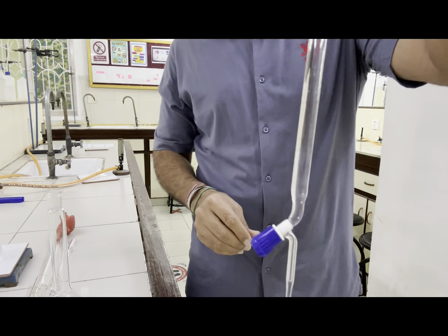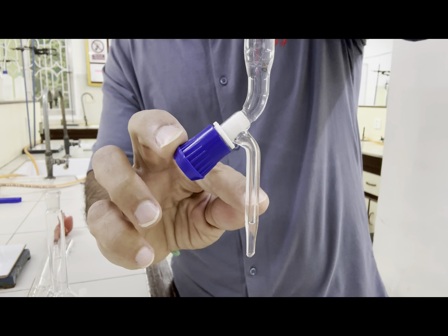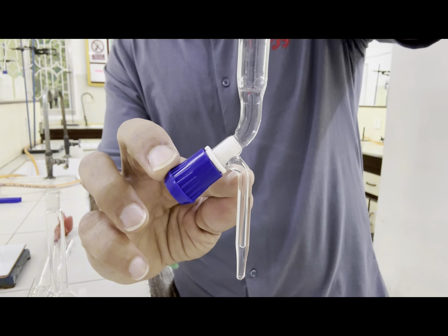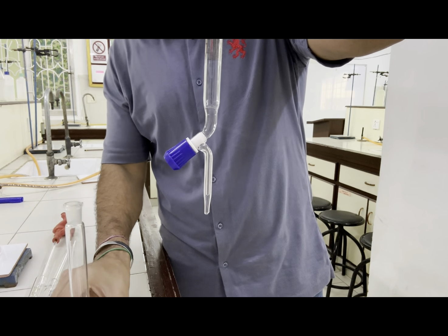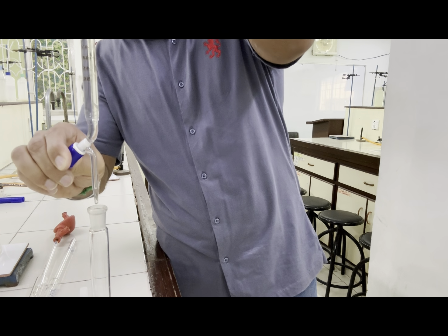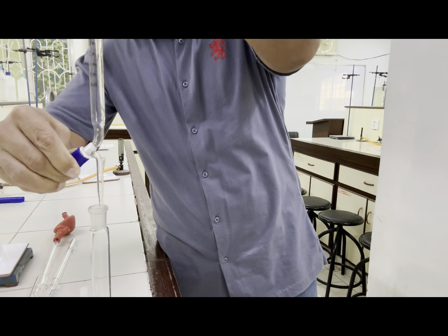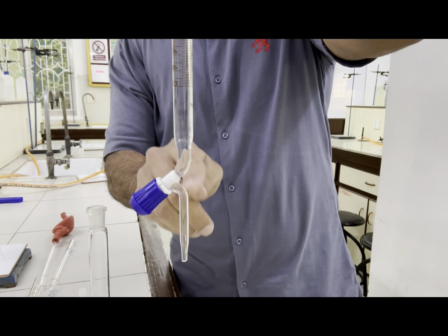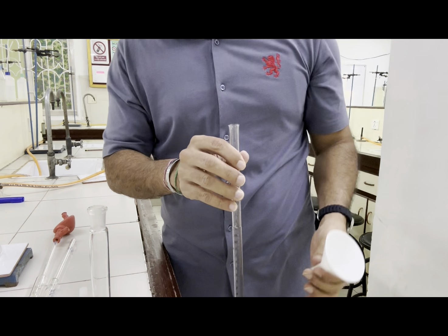Now have a look at this lower end. There is a volume in this burette which is below this knob, and this needs to be filled also. Therefore we will open this knob so that the solution will drain out and then close. And now you can see this column is filled. Actually this includes in the volume we have filled here. So it's necessary to fill this column also.